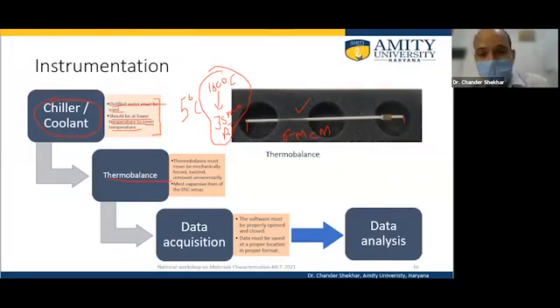On top of this thing it goes down, and at the end the sample and reference are kept. So the thermobalance must not be mechanically handled at all, neither forced, twisted, nor removed unnecessarily. And this is the most expensive item of the entire instrument.